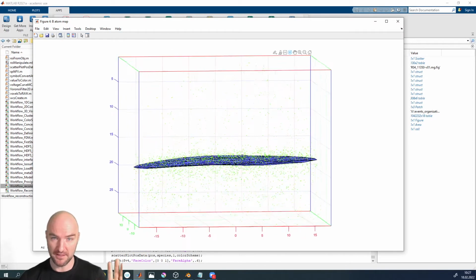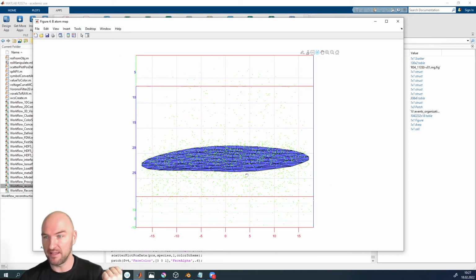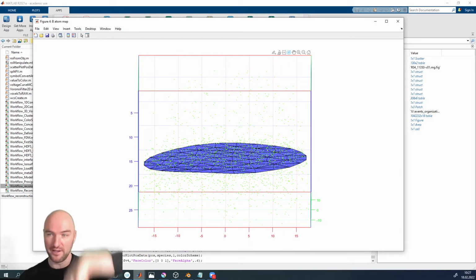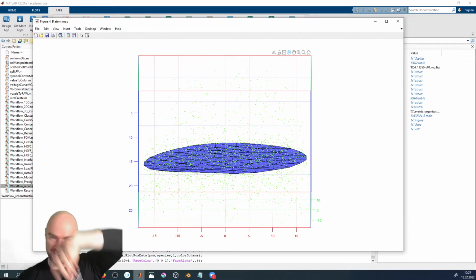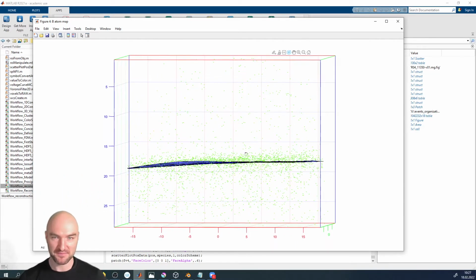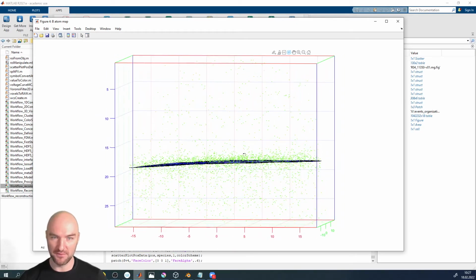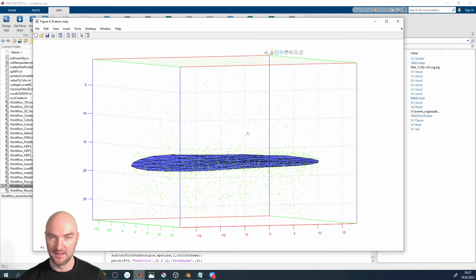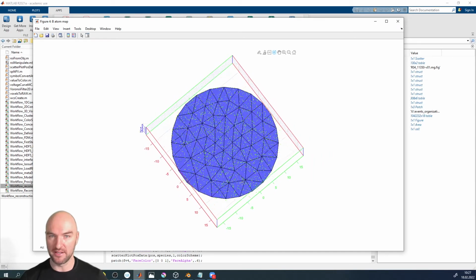So the snapping to the atoms only works if you've got enough atoms to do that. Sometimes you don't. Then you might need to go back and manually edit where the boundary sits, because one vertex might have been pulled up to somewhere in space. So there might be some manual work involved, but in the end, if it looks really good, then probably it is really good. And this would be the basis then of your analysis.